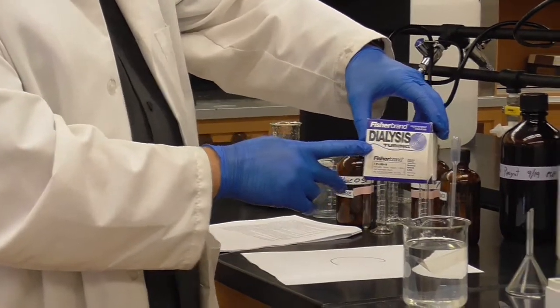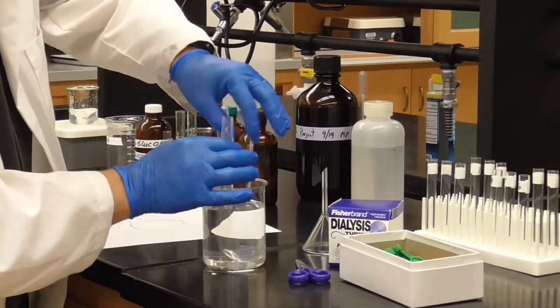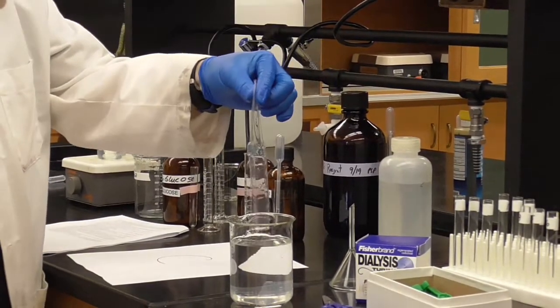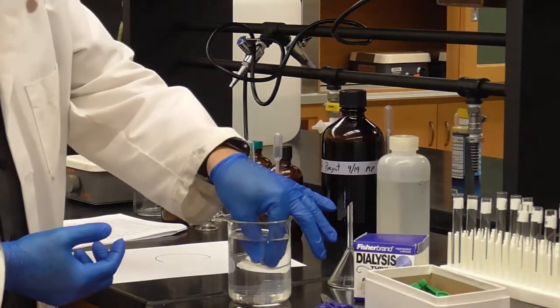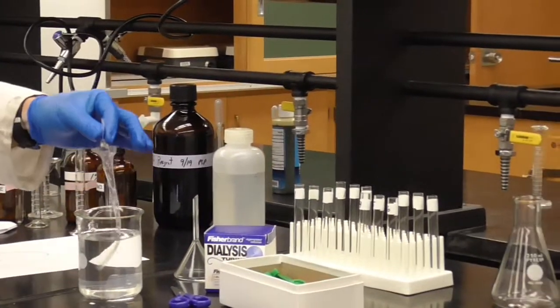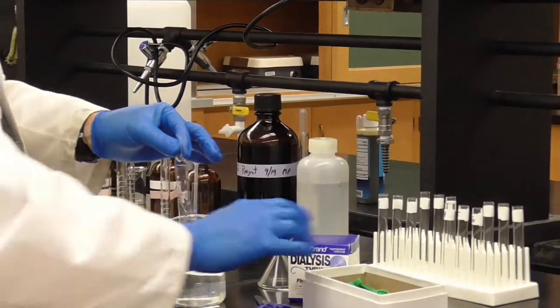Dialysis tubing is a tube, as you can see here. Looks like just a clear plastic tube. It is hollow, and so it's like a garden hose sort of a thing, right? And it is made of semi-permeable material. Right? We've got them soaking in DI water. That's just to rinse them off, and once they become hydrated, they open up into the tube.